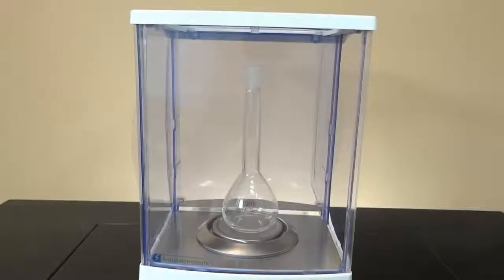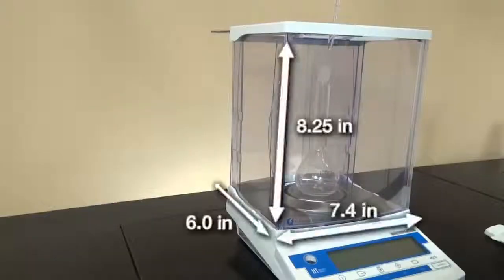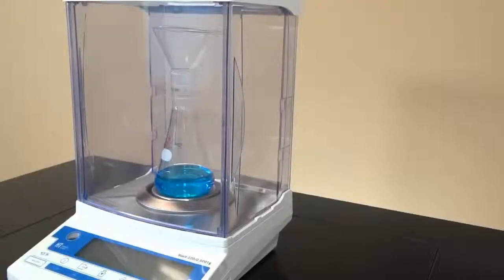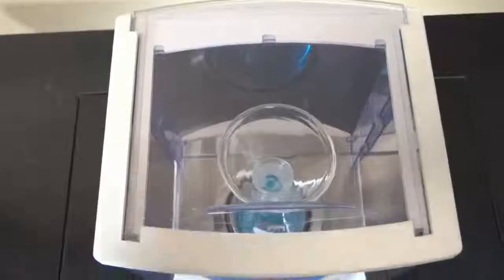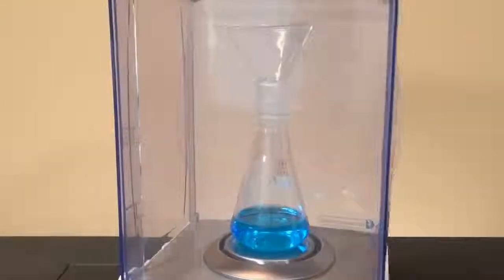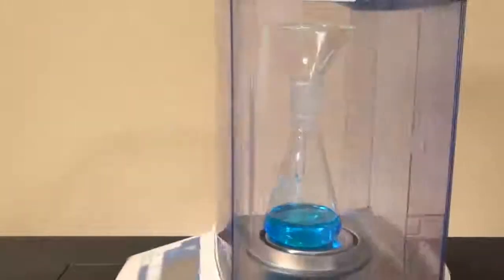The spacious weighing chamber offers plenty of room for large samples or pipettes. The HT has three anti-static draft shield doors. The weighing chamber allows viewing from all four sides and from the top.